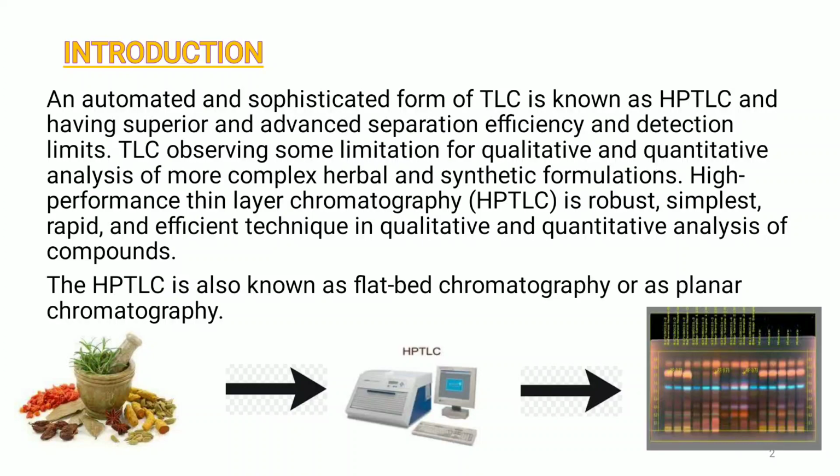High performance thin layer chromatography is a robust, simple, rapid and efficient technique in qualitative and quantitative analysis of compounds. HPTLC is also known as flatbed chromatography or planar chromatography. It is an enhanced form of thin layer chromatography.